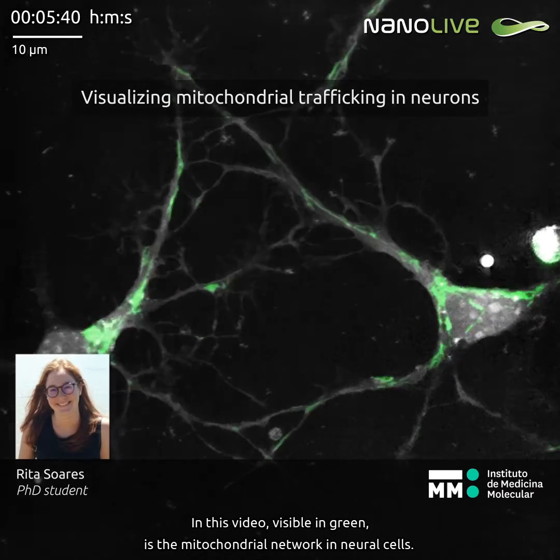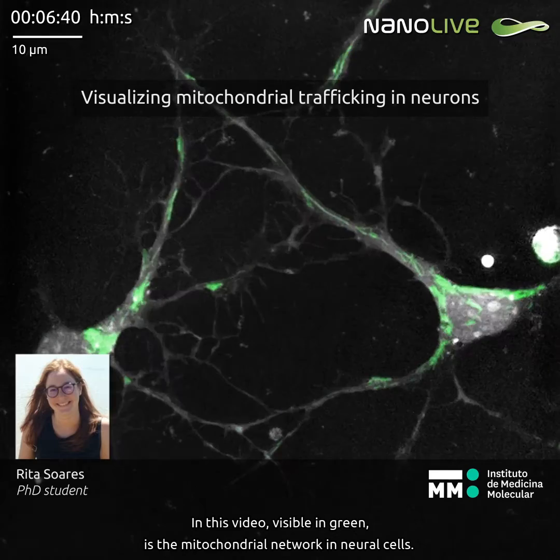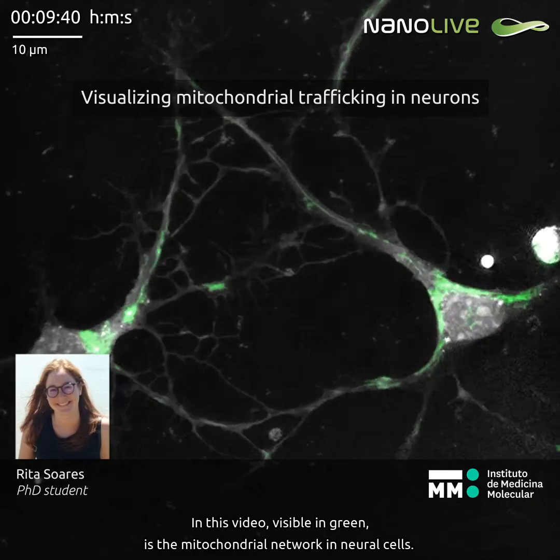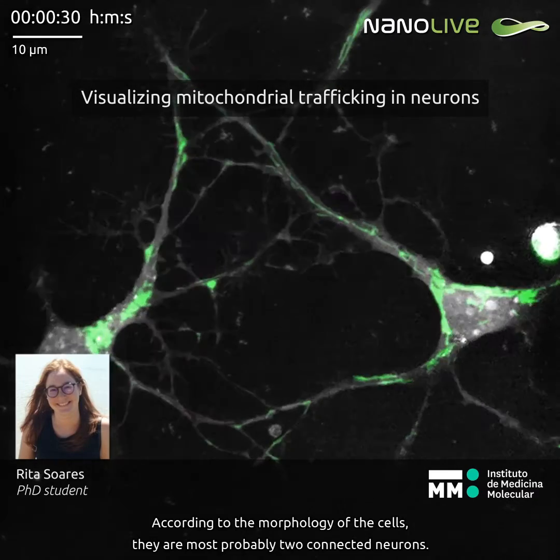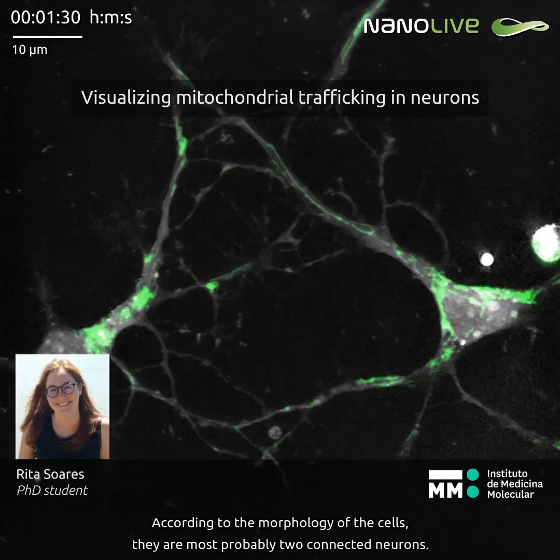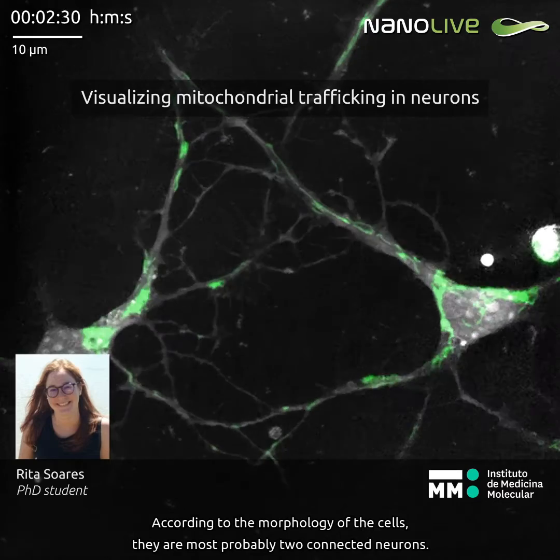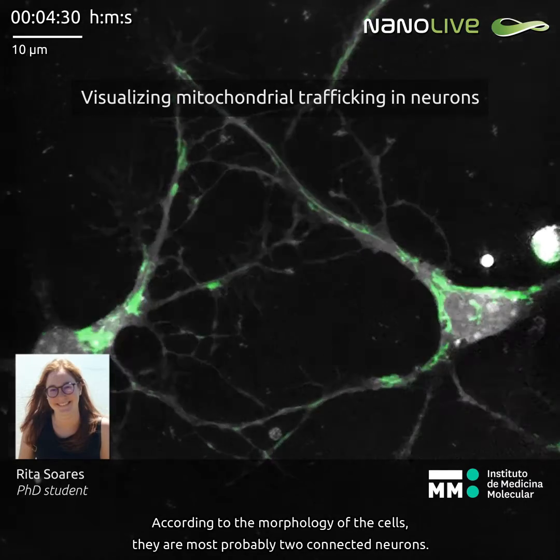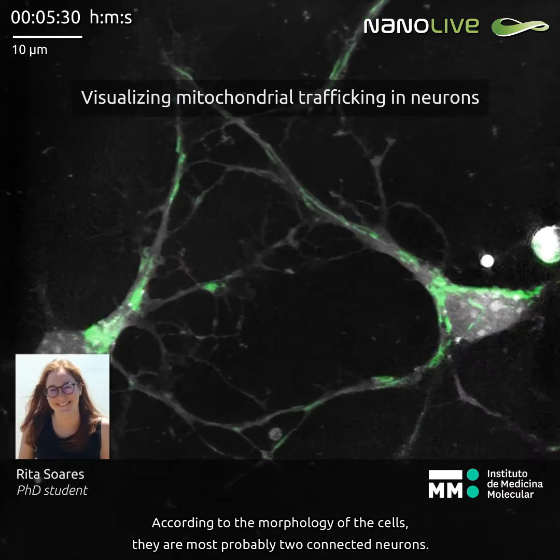it is visible in green the mitochondrial network in neural cells. Accordingly with the morphology of the cells, they are most probably two connected neurons.